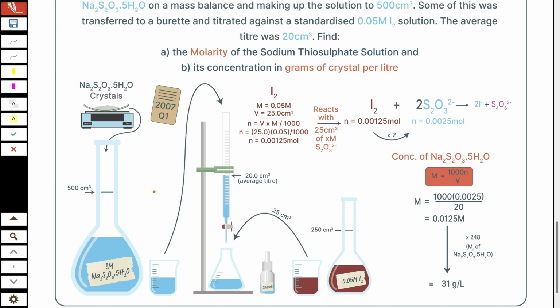And any drops left behind, you are sure that they are just deionized water. You'll bring the solution up to close to the mark with the wash bottle, and then the dropper will bring the bottom meniscus up to the mark. So basically the procedure that we had in mandatory experiment 7.1, where we described the making up of a standard solution of sodium carbonate. So it's essentially those steps, but this will come up. It has done. Anytime this question has been asked previously, they've asked you to list the steps in making up the sodium thiosulphate solution. So make sure you're clear on those points.